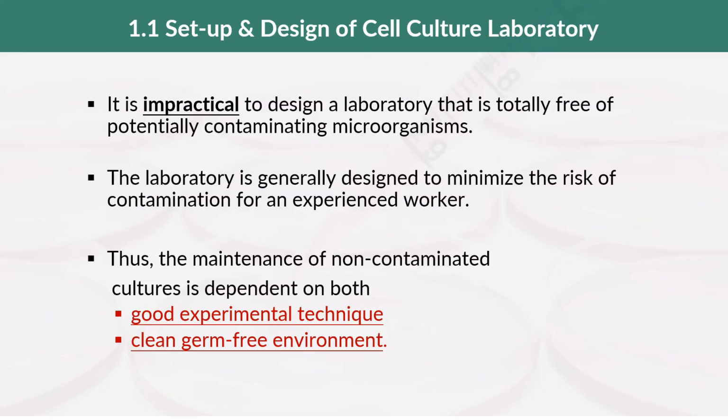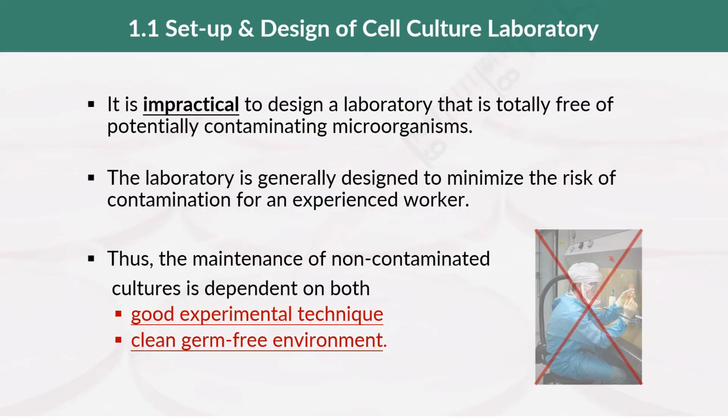So the maintenance of these non-contaminated cell cultures that you're going to be growing depends on two key things. One is your good experimental techniques, and second is your ability to maintain that clean, germ-free environment where you are working with your cell cultures, so that you don't even need to gown up like this every time we go for our practical sessions.